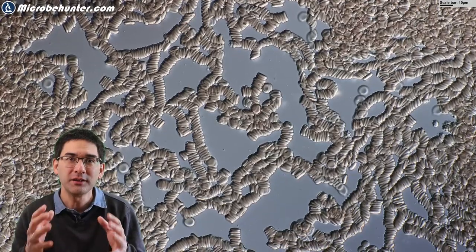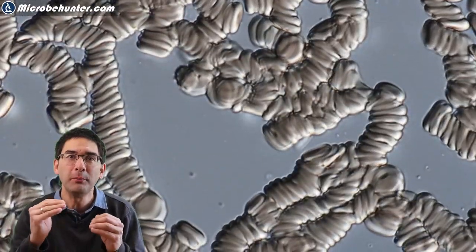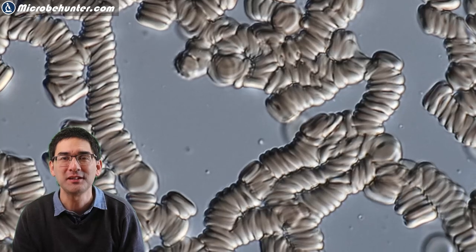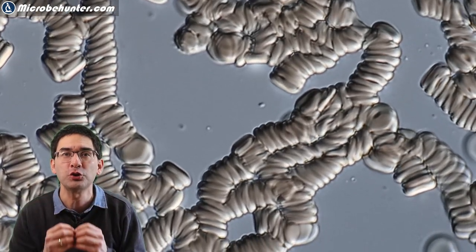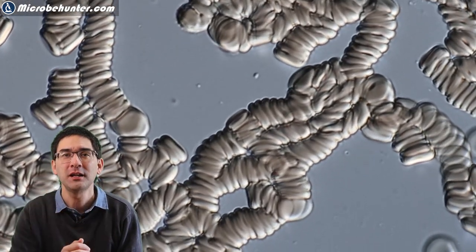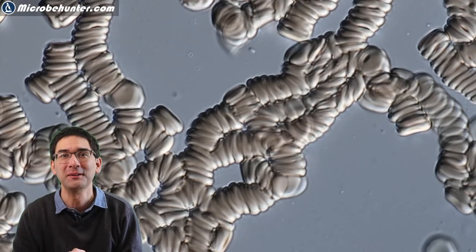Sometimes the red blood cells under the microscope start to stack up on top of each other, just like you can see over here. This is called rouleau formation. It's almost like a stack of coins. This is a natural process that happens when blood starts to coagulate.